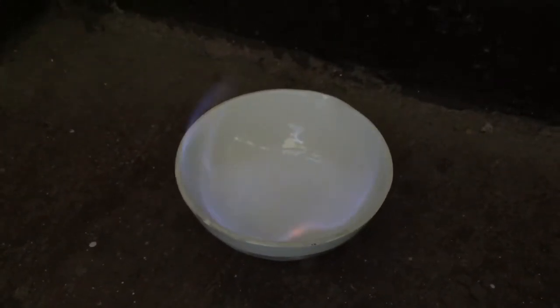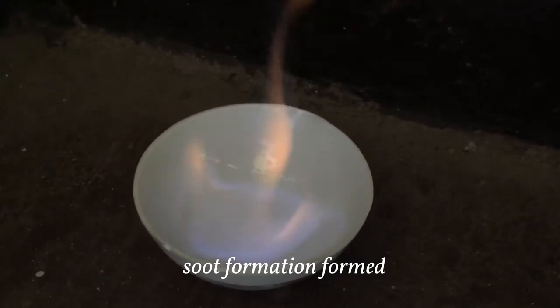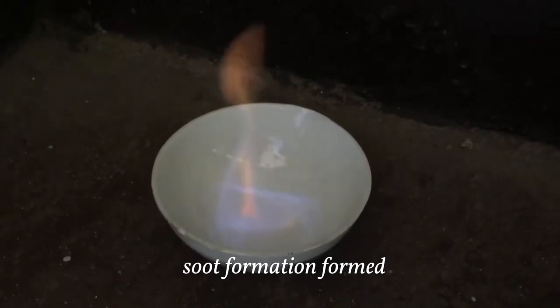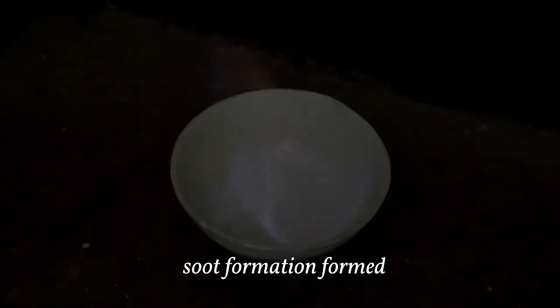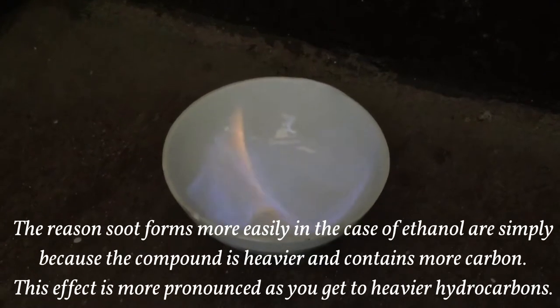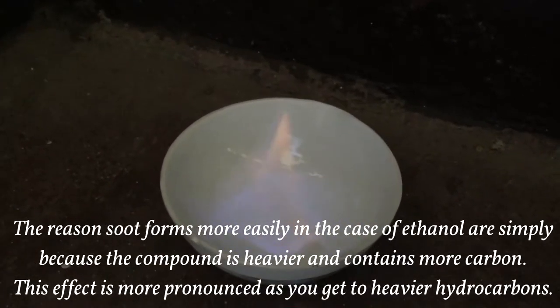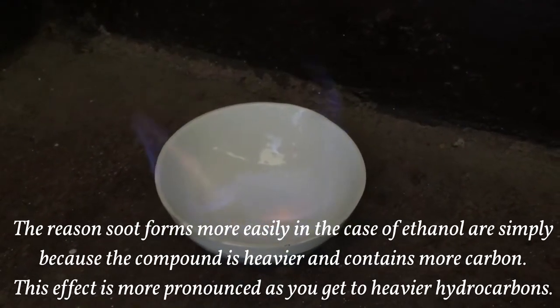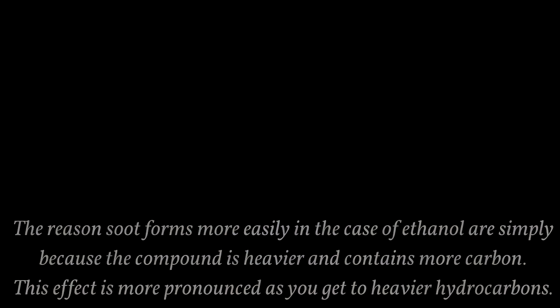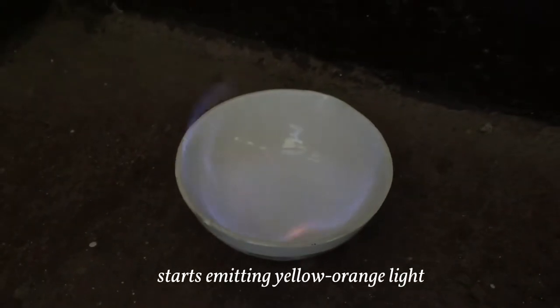As the flames start to burn, ethanol starts to have some yellow plumes. The yellow color in the case of ethanol comes from the formation of soot. Soot is essentially carbon-containing, consisting of a large number of byproducts from incomplete combustion. The reason soot forms more easily in the case of ethanol is simply because the compound is heavier and contains more carbon. This effect is more pronounced as you get to heavier hydrocarbons. The soot in turn becomes heated up by the flame and starts emitting yellow-orange light.